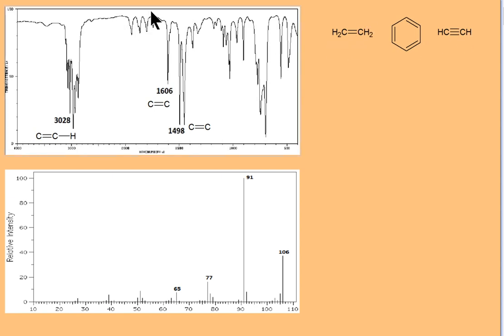the alkene because we'd normally expect a stretching vibration for the double bond further to the left between 1680 to 1640. And we've also got the CH stretching overtones in the 2000 to 1600 range, which is again characteristic for a benzene ring. So it does look like we've got a benzene derivative. If we check the molar mass at 106, it's just a benzene derivative.